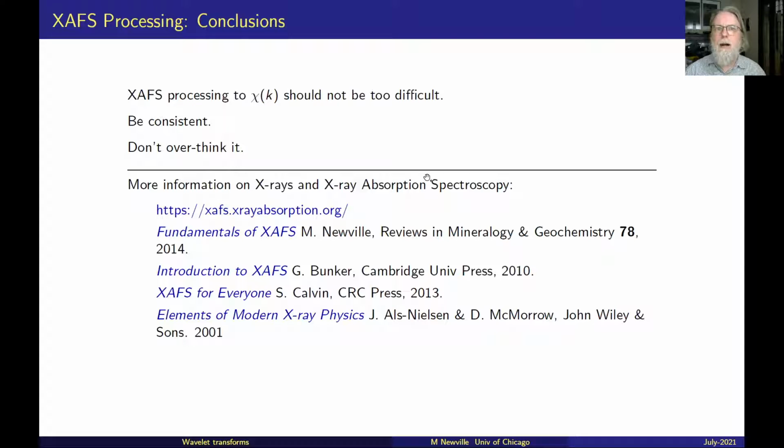So I think I've gone way over my hoped for time on this video. So the conclusions for XAFS processing are that XAFS processing, although I talked about it quite a bit, should not be too difficult. And the main takeaways are don't overthink it and be consistent.